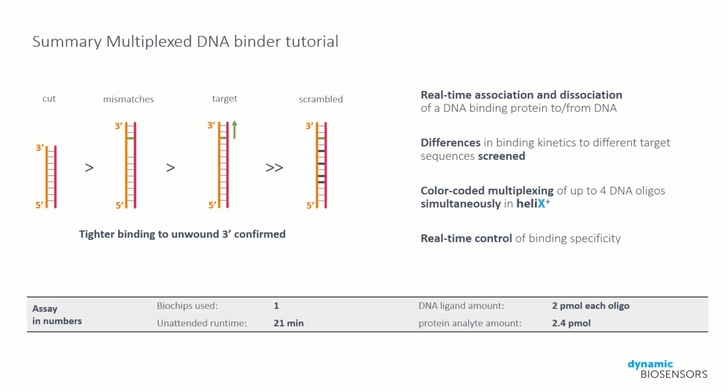We have shown the effects of several changes to the T7 promoter on binding kinetics. While it is required for promoter activity that T7 RNA polymerase bind its promoter sequence, it is apparent that binding that is either too weak or too strong can negatively impact transcription. In more complicated systems where promoter activity requires the presence of one or more transcription factors, it may be important to look at binding of multiple proteins to fully understand the effect of DNA sequence changes on transcription.